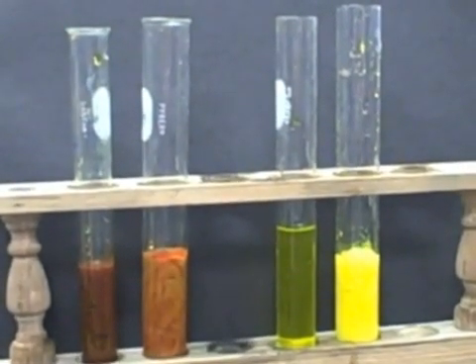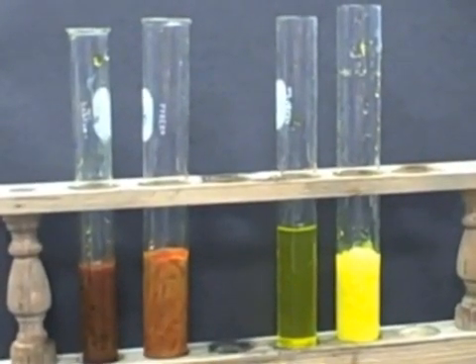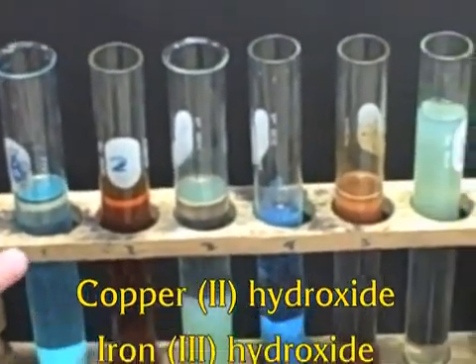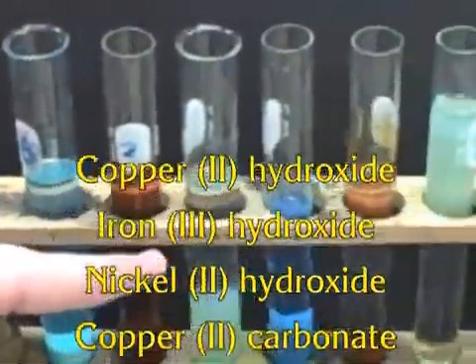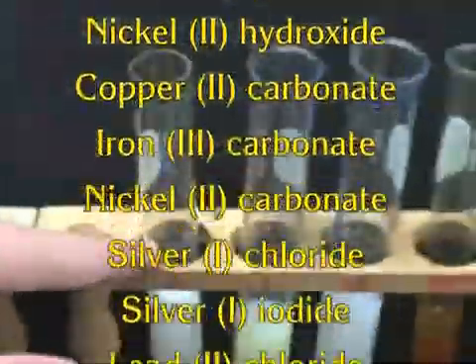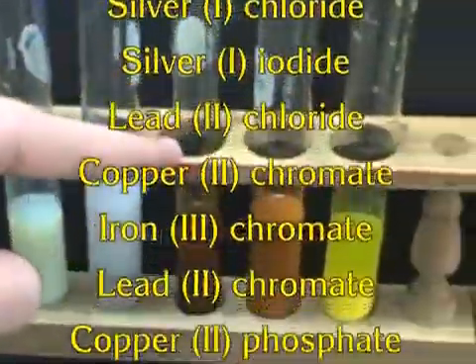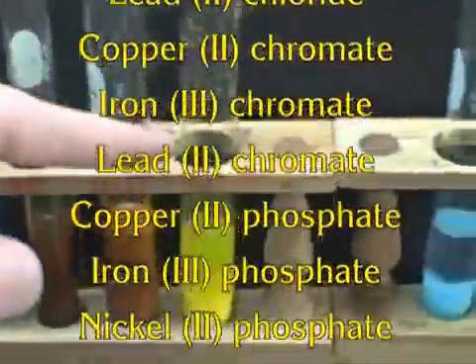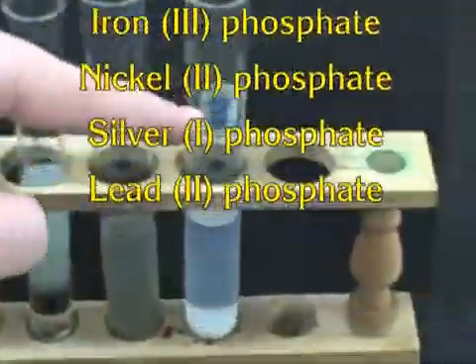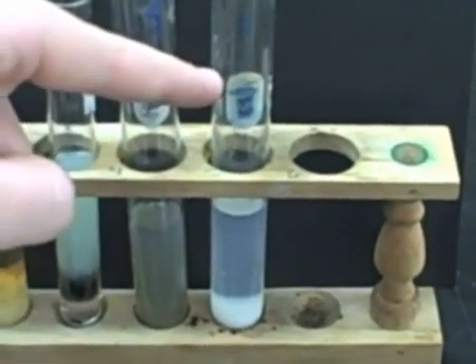And now we're going to do two that are classic and a real original one. And we're going to do those in flasks. So this is our final lineup here. We've got copper hydroxide, iron hydroxide, nickel hydroxide, copper carbonate, iron carbonate, nickel carbonate. Next rack we've got silver chloride, silver iodide, and lead chloride. And then we've got copper chromate, iron chromate, and lead chromate. And then over here we've got copper phosphate, iron phosphate, nickel phosphate, silver phosphate, which has actually turned a blackish color, and lead phosphate, which is still milky white.